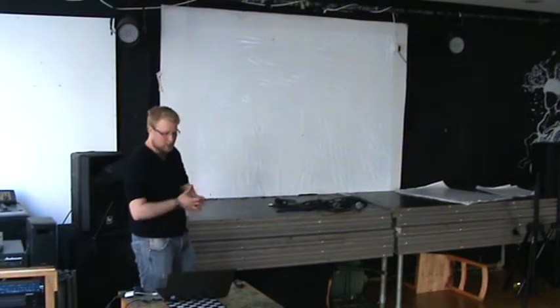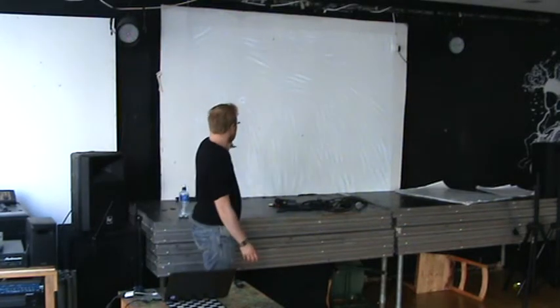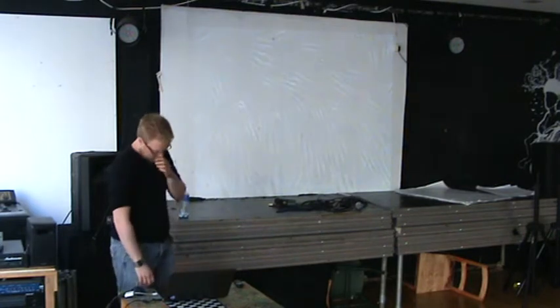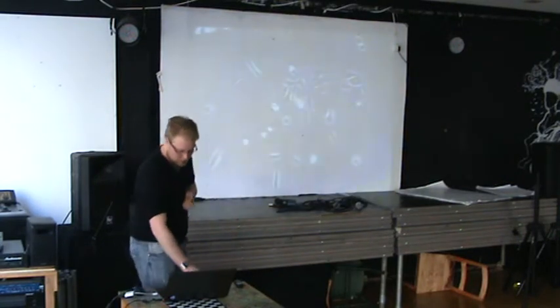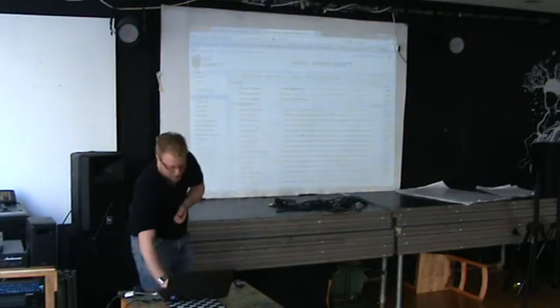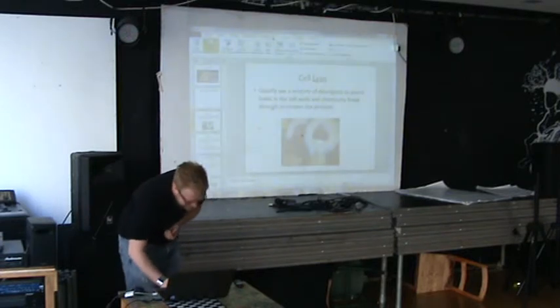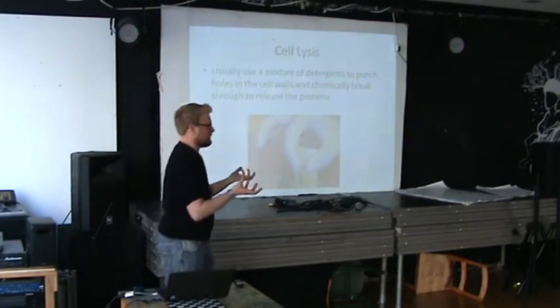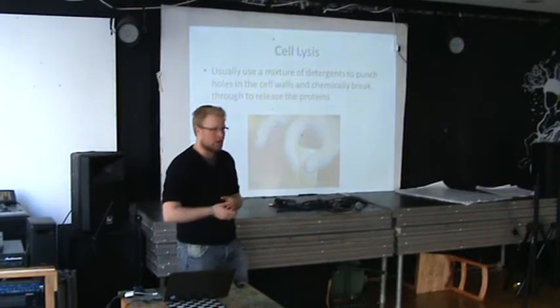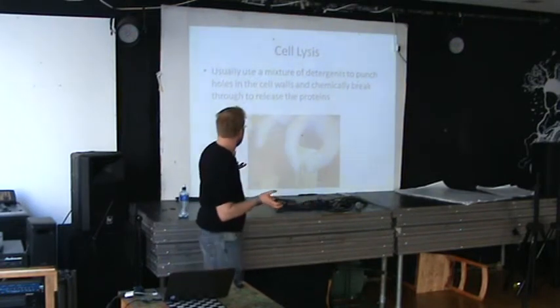In 3 days I can split 1 dish of cells into 5 dishes of cells. So you can see these divide crazy and they just take over. Some cancer cells have cell migration as well, and I'm not going to show that because I just showed it. So then you've got your samples. You've got your immortal cell line, you maybe treated them with drugs, and you've got the brain neuroblastoma cells that I work with.